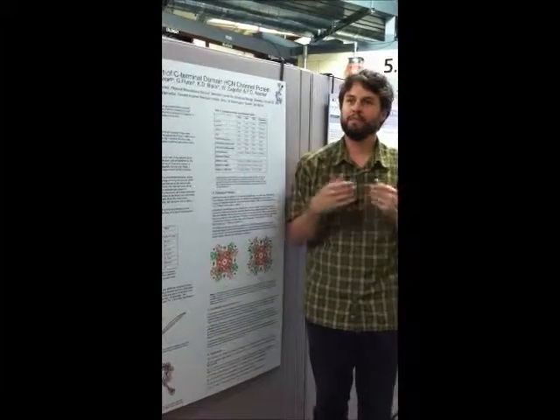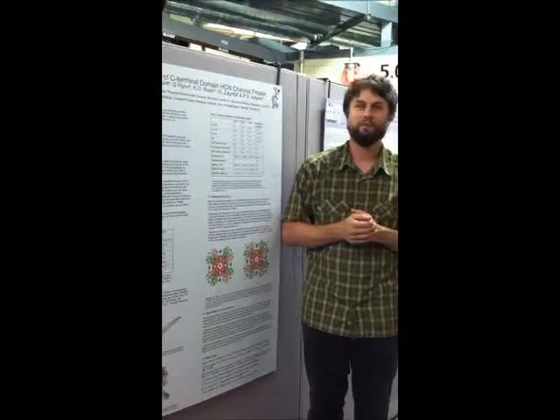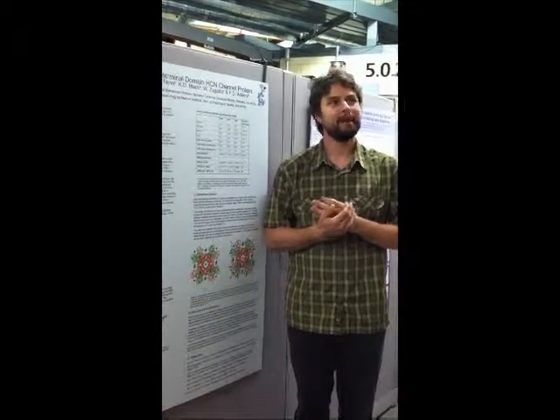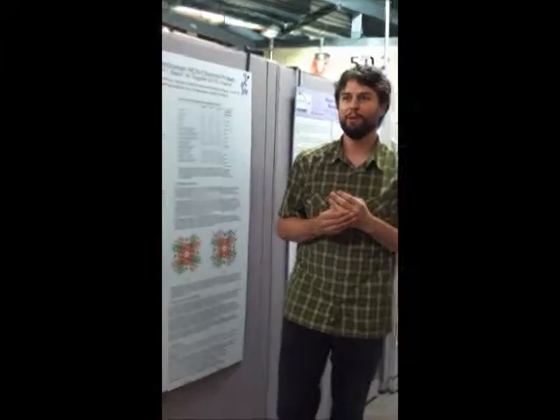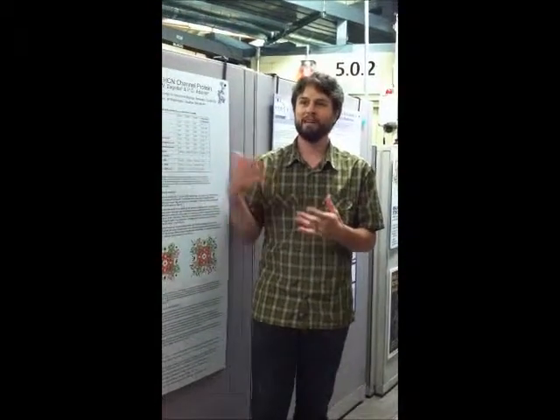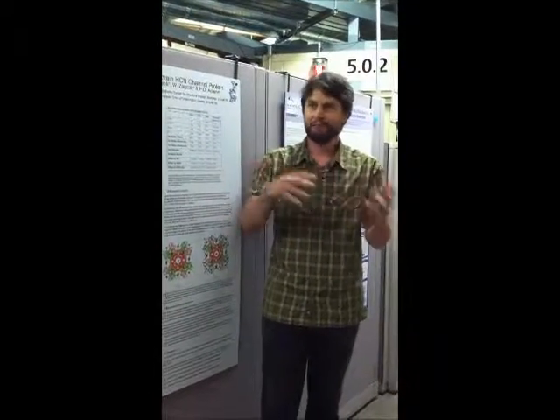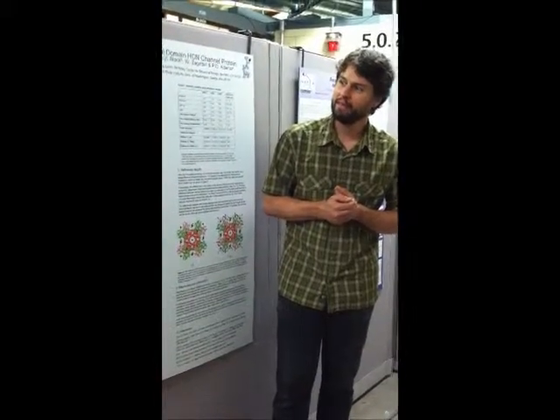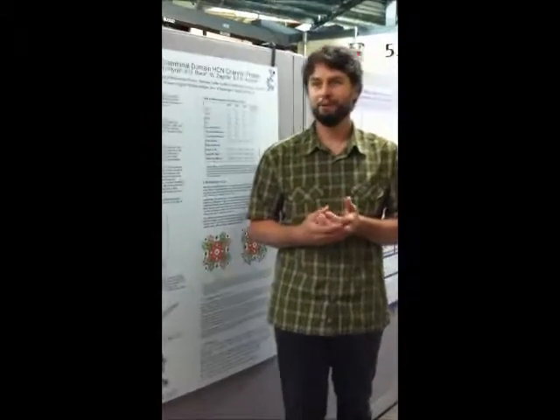And they measure all those spacings, and they can calculate eventually where all the atoms are in one of these structures. And it's not really that easy. You can't do it by hand anymore. You can do it by hand for silicon or some simple material. But these involve a computer model, iteration of predicting what you think you're going to see, comparing it to what the model says, back and forth, back and forth. But eventually they get a structure. And then they figure out what it's doing, how to prevent it.